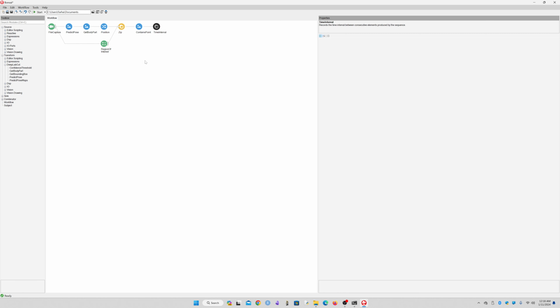In fact, we don't technically need this, but I personally prefer to have this. However, if you just need the two things, for example, the number of entries and exits and the total time that the mouse is spending within a given ROI, you can just keep this as is and just attach a CSV write out.